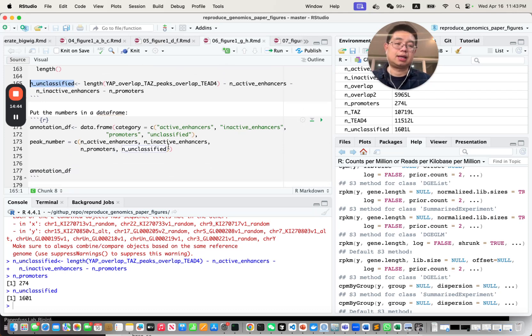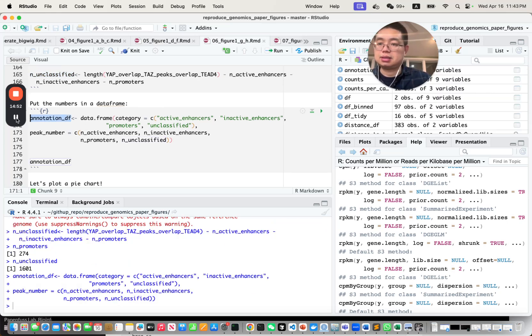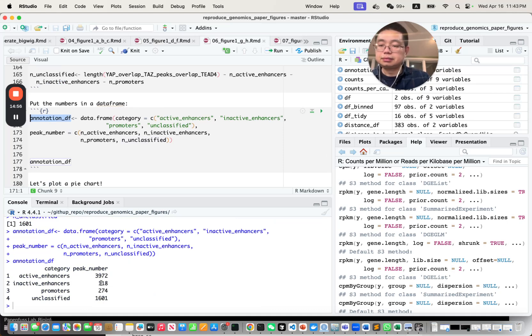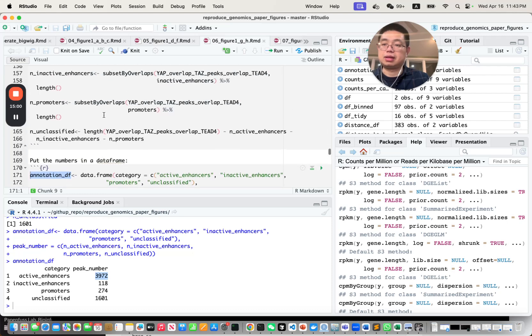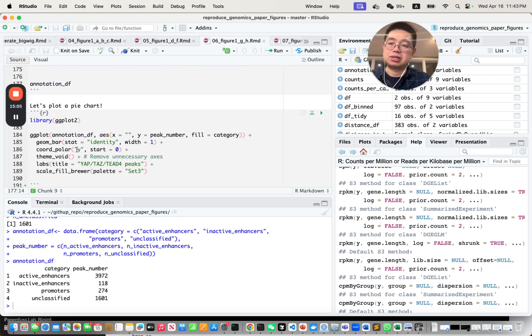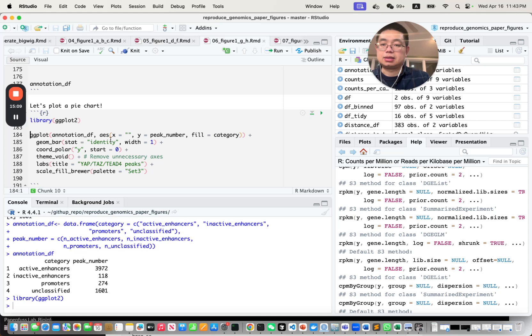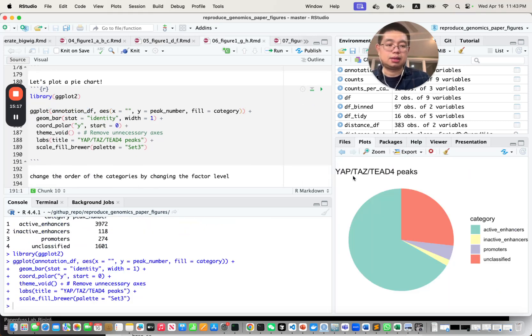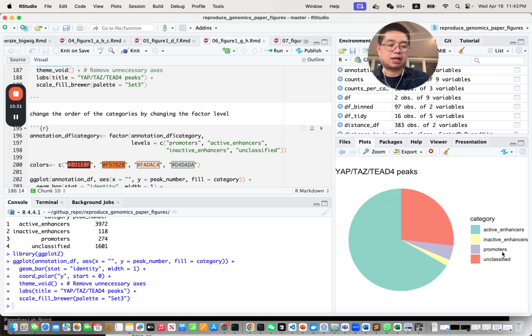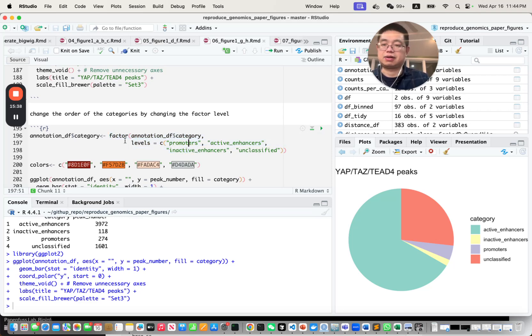Once we have all the numbers, we're ready to make a pie chart. First, put them all into the same data frame. Then use ggplot2 with a bar plot using coord_polar to produce a pie chart. We can change the order of categories by adjusting the factor levels: promoter first, then active enhancer, inactive enhancers, and unclassified — using the factor function to re-level.